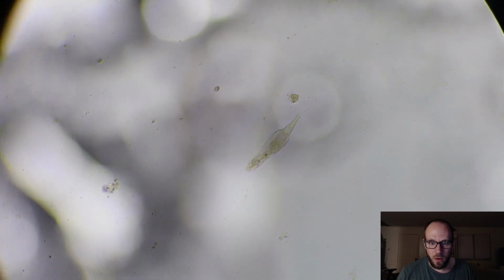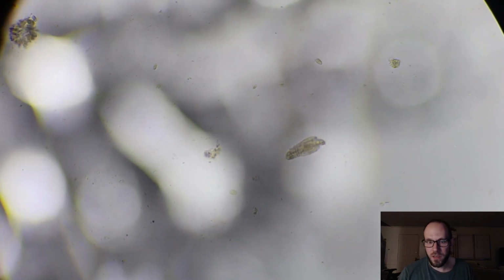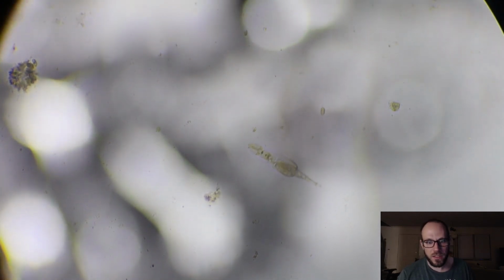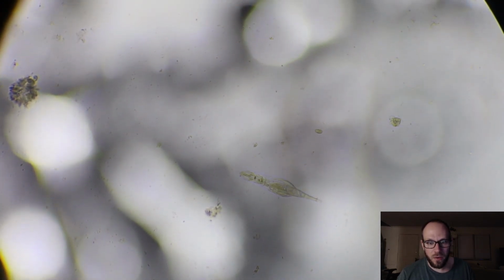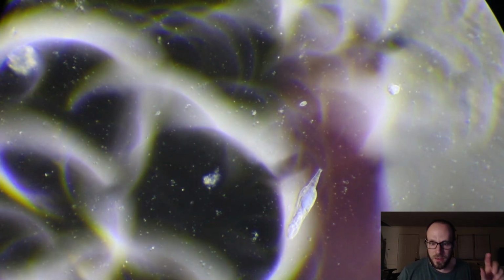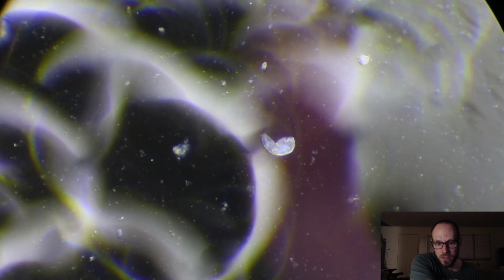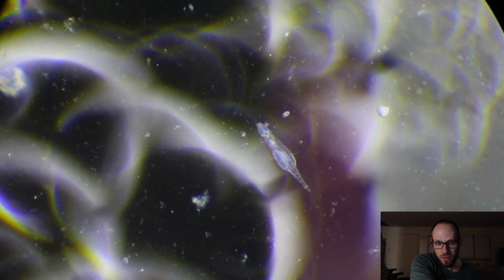I looked at a slide earlier, so I had this sample I was telling the story. I've had it for about 2 weeks, and over the weekend, the water just started turning red, and the day before yesterday, it was just crimson. And I was like, what is going on here? I looked at it before, and there were countless thousands of extremely tiny organisms swimming around. But then today, I looked at it again because it started to turn brown and clear up. So I got a sample of the red water from the top, because there was a little bit of that left, and a sample of just water at the bottom, which was clear. And it appears that a bunch of bacteria just bred like mad and killed everything off.